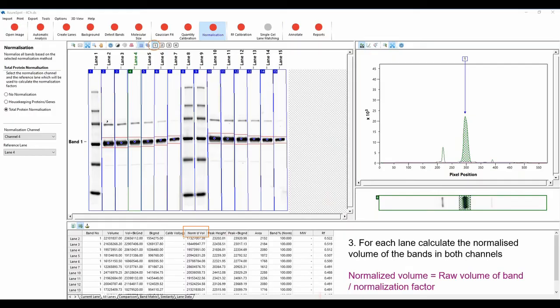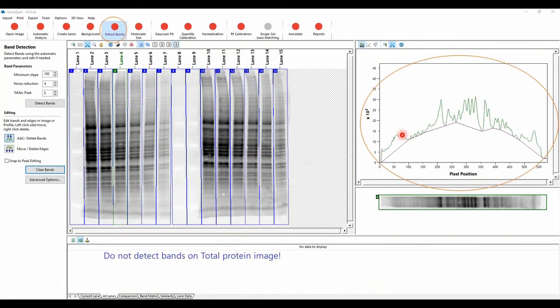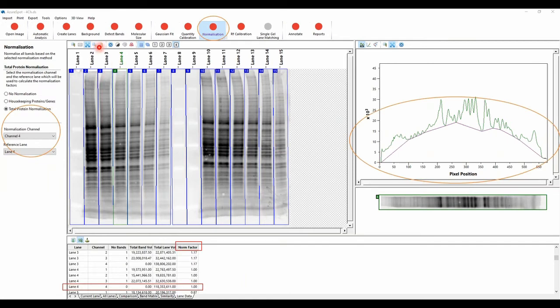Yeah. So this is pretty much how you use analyze it. In fact, you can also do this in ImageJ. The idea is very simple. Get the lane, get all the volume, all the pixels, all the signal intensity, everything. Then remove the background. You can either choose the background or use a different way to define the background.